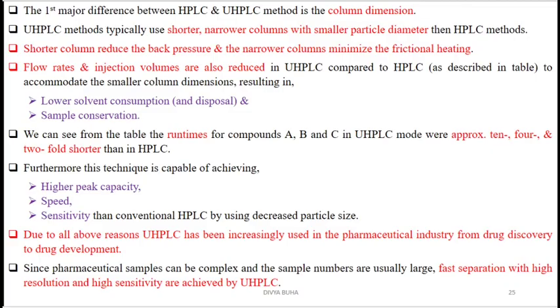And in some cases, what happens is that you will have very little amount of the sample, right? So it would be difficult to go for HPLC, wherein a larger sample injection volume is required. So in such cases also UHPLC would be preferred as compared to HPLC.